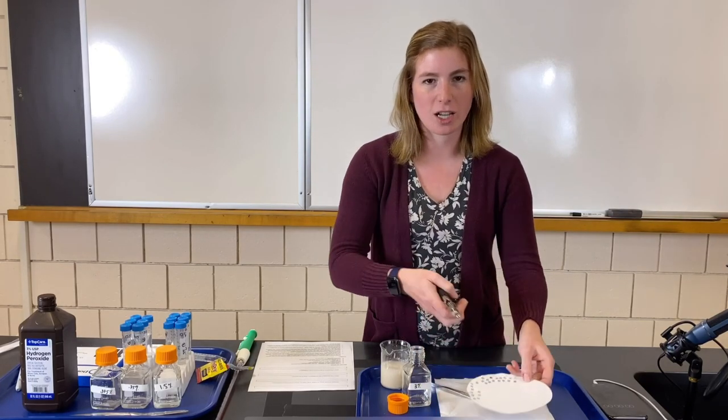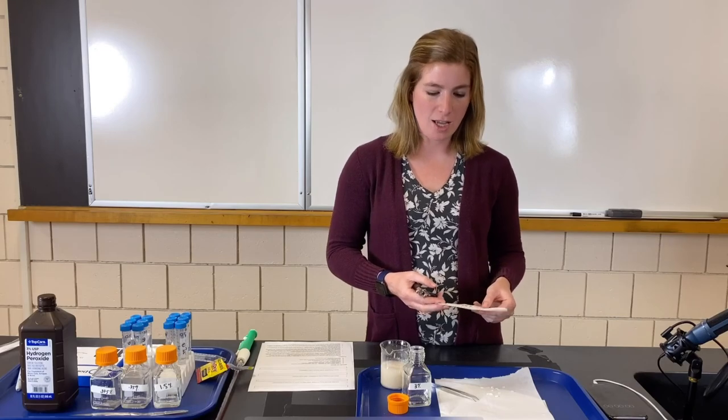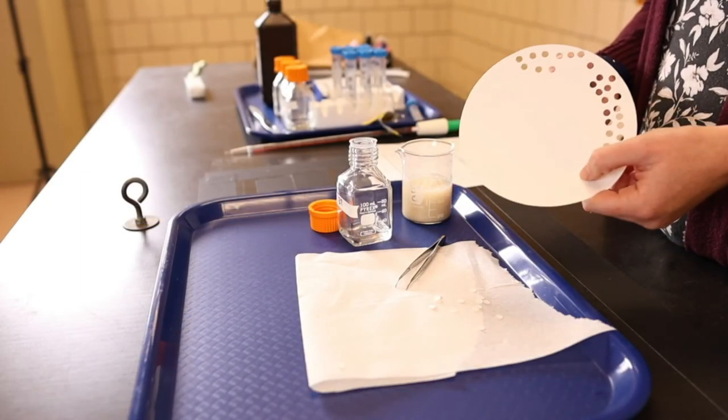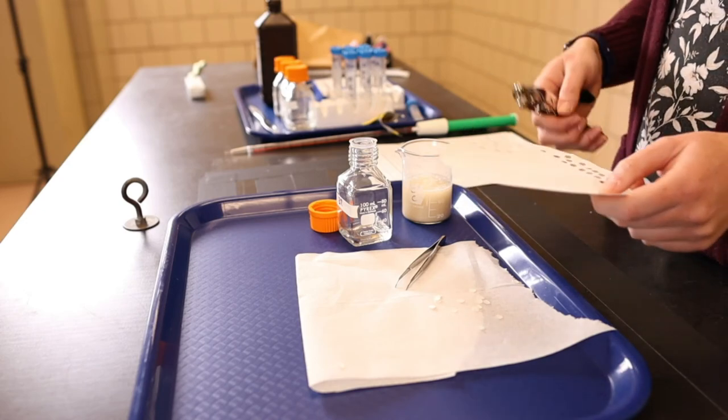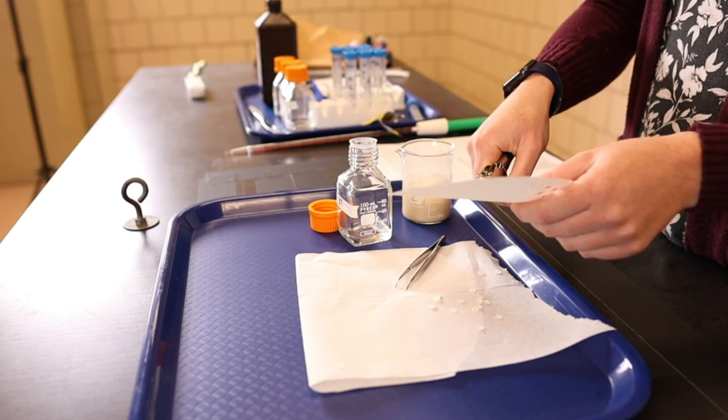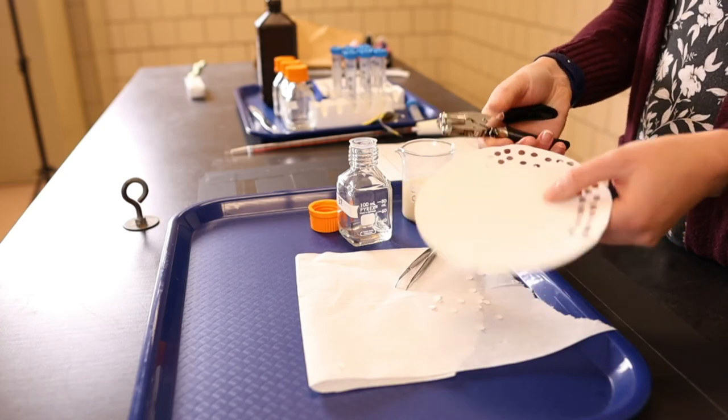The next step is to cut out our filter paper disks. I've cut out a few already, but here's how it's done: grab a piece of filter paper and a hole punch, then simply punch out the disks. Pretty easy.